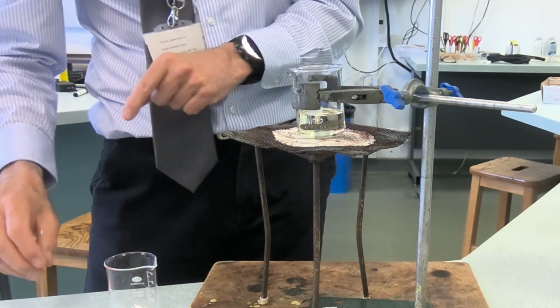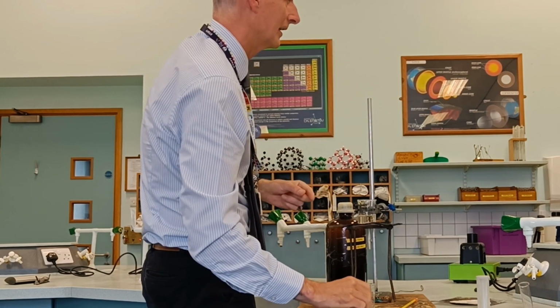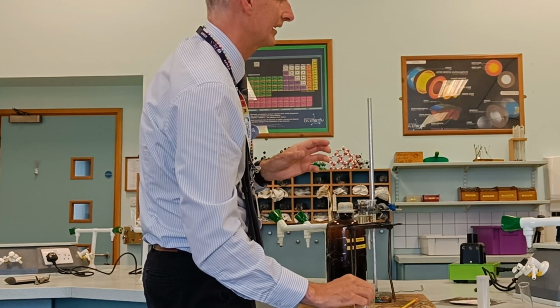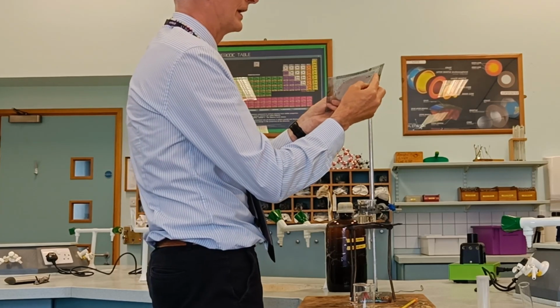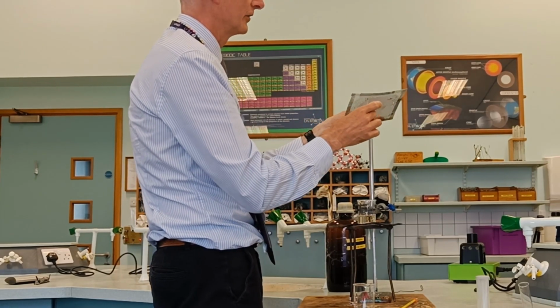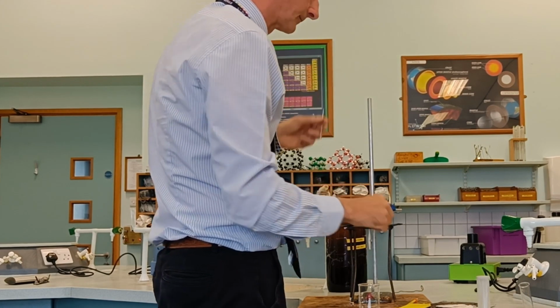There are various ways you can do it. You can just try tapping it and see if some of it's gone down. The drier the sample is, the easier it is to get it down to the bottom. There's another little trick you can do: if you take a gauze and rub the open end across the gauze, the vibration knocks the solid down to the bottom. Okay, so there's enough there to see.